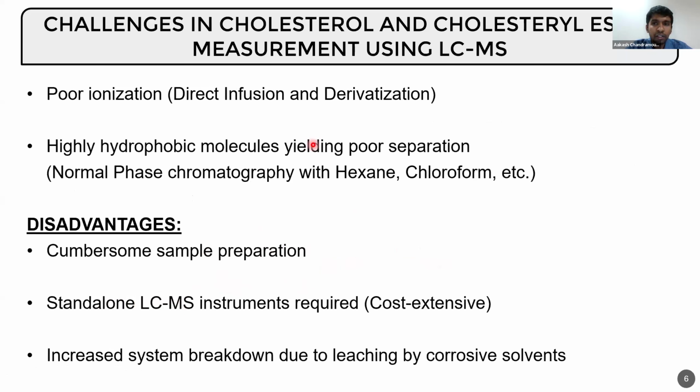The challenge in cholesterol and cholesterol ester measurement using LCMS-based lipidomics is that these molecules are generally poorly ionizable, and to circumvent this, people have tried to use direct infusion techniques or to derivatize these molecules in order to ionize them in a better manner.